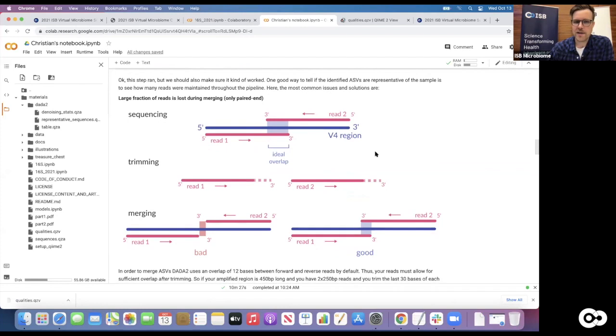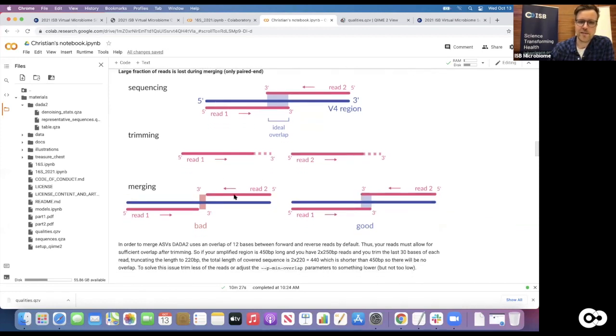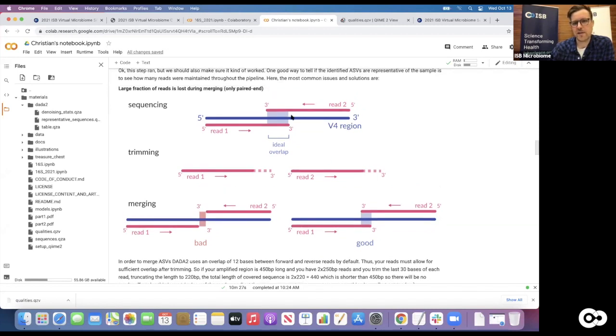Now I might do the quality analysis, and I might think I'm doing really well by being super aggressive. I will cut off a lot of the end of each read to get really high quality reads, which intuitively seems like it makes sense. But then you might get into a case where you cut off so much of the trimmed read that the overlap is completely gone, right? Because both ends of the read overlap, so if you trim off the ends, you might lose that overlap.